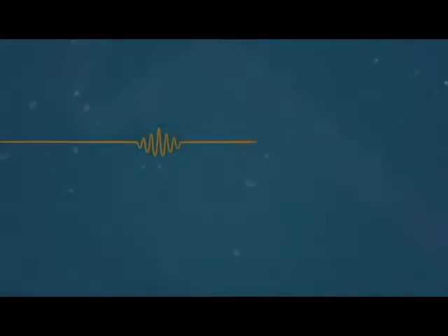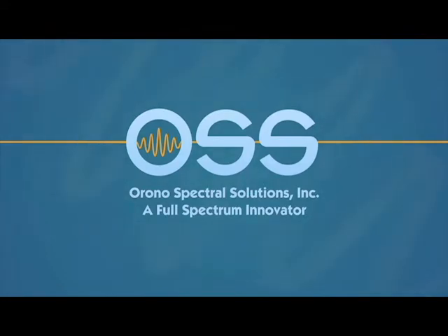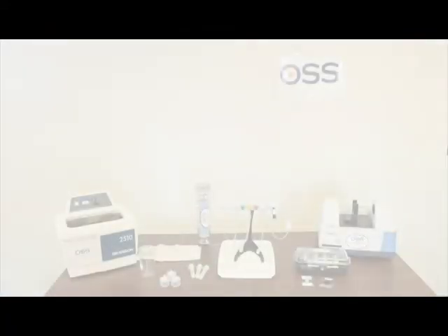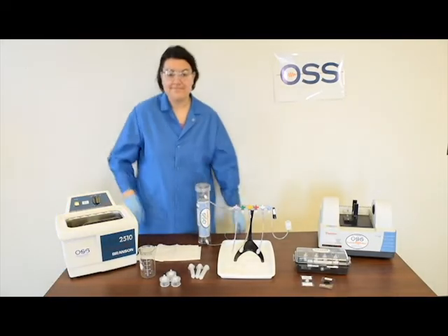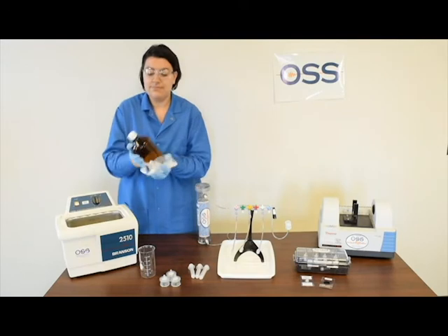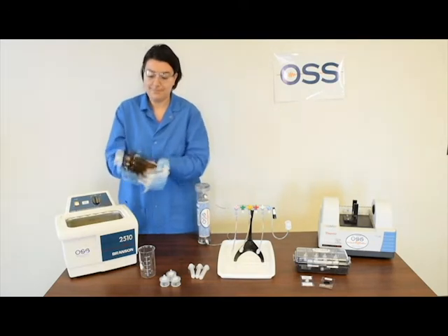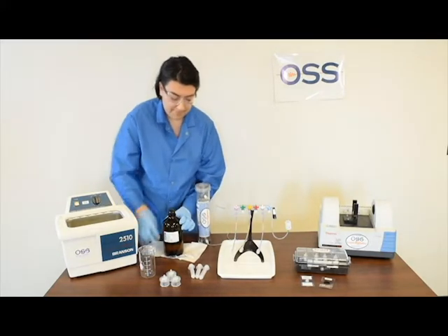With Orono Spectral Solutions' ClearShot technology, measurement of oil and grease in water has never been easier. Proven equivalent to EPA 1664 with a robust multi-laboratory validation study, this solvent-free, streamlined, and efficient method starts with homogenizing the sample and removing a portion of the sample with a syringe.